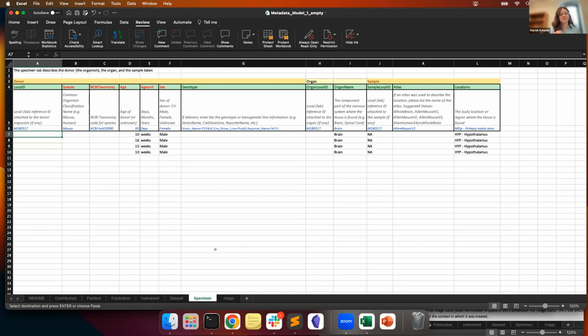Things like dataset 1, dataset 2, those aren't as truly useful for us. We want to make sure that if you're including data sets across multiple submissions, we can link those. And so including an ID here that is unique is really important.